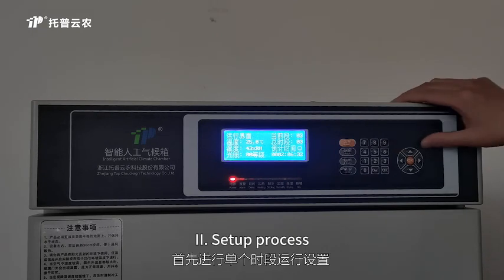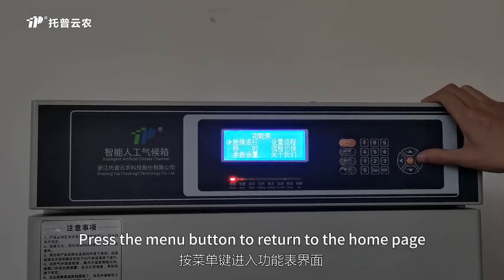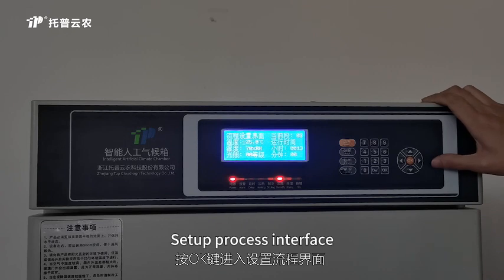2. Setup process. Press the menu button to return to the home page. Switch by the left and right buttons. Press OK to enter the setup process interface.